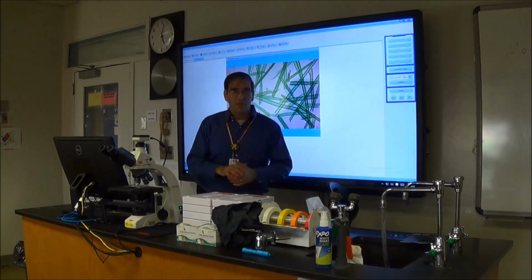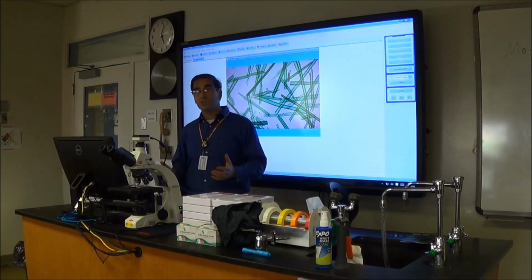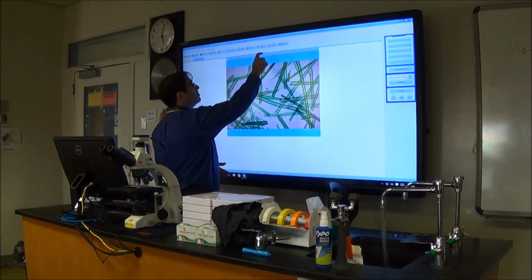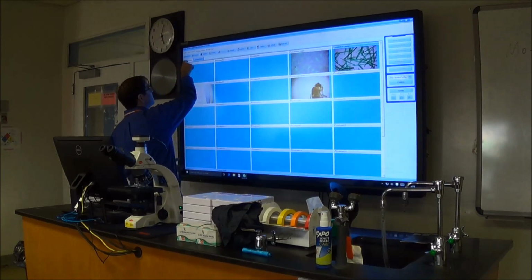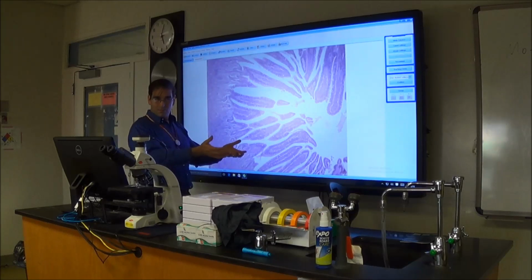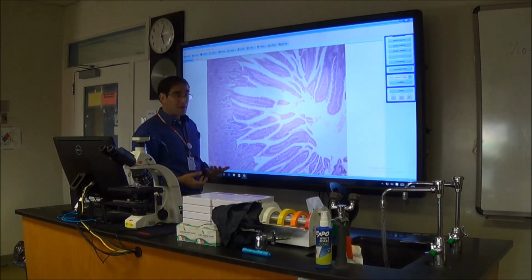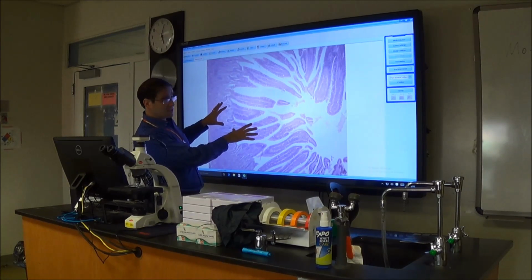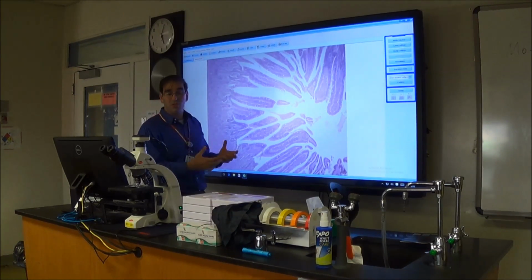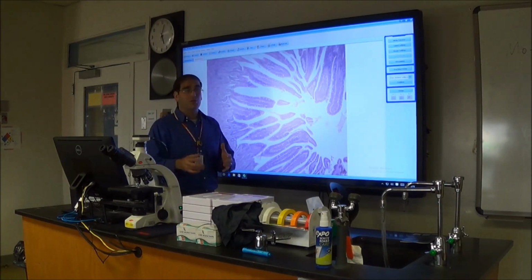Okay, so the next thing that you're probably asking is, this is great. I can see what the students are seeing. I have a high resolution microscope myself, so for instance, under the teacher image, I can show a really nice image to the students what I want them to see. How do I take some of these images with me? Maybe I want to capture this image for later. Maybe I want to send this image to the students. I found a really good example of a white blood cell, and I want to show that.